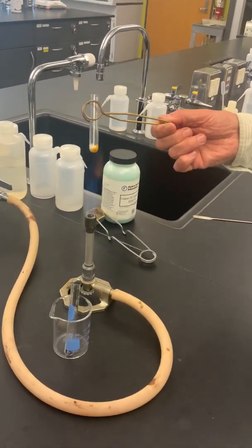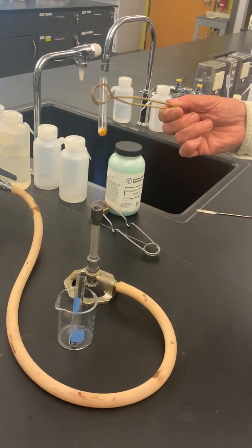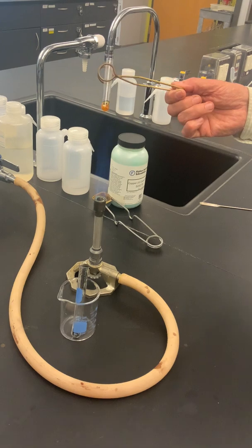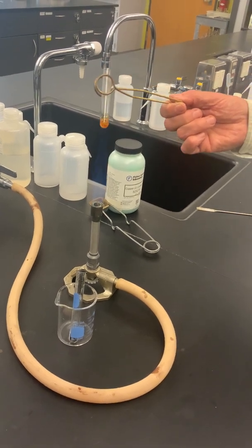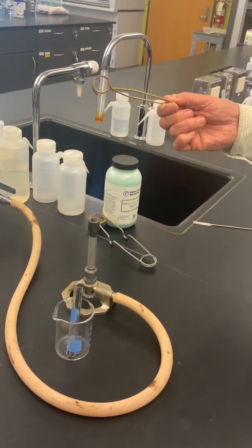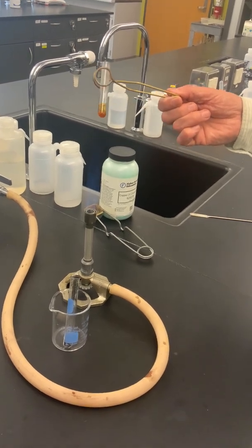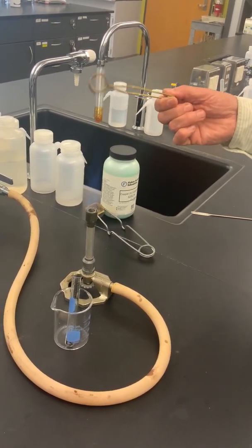In this case, heating it very, very slowly, and of course many of you have already done this chemical reaction in a campfire or something, where you take that sugar and decompose it into simpler substances.